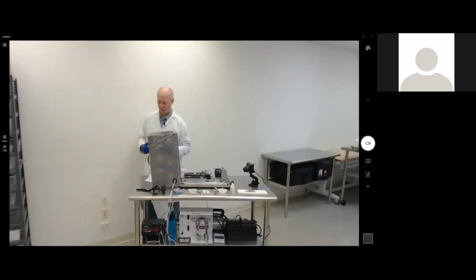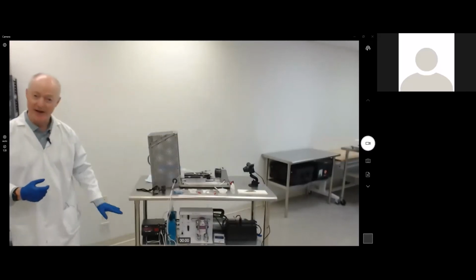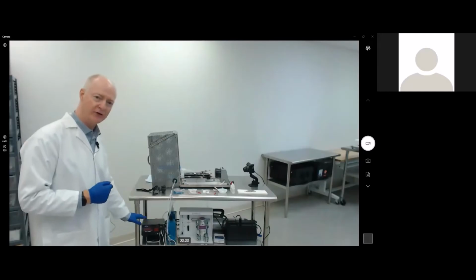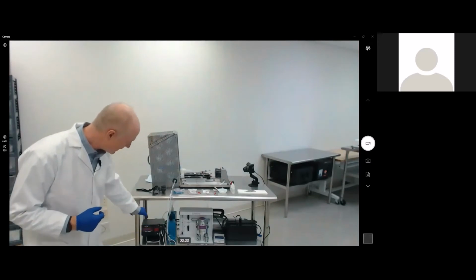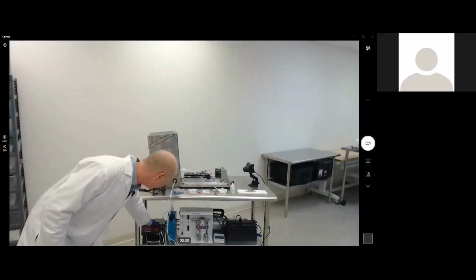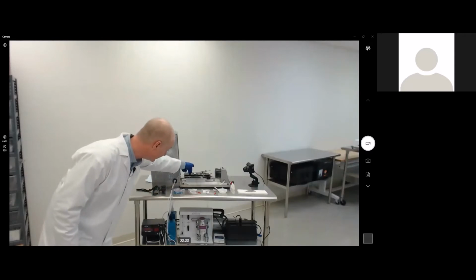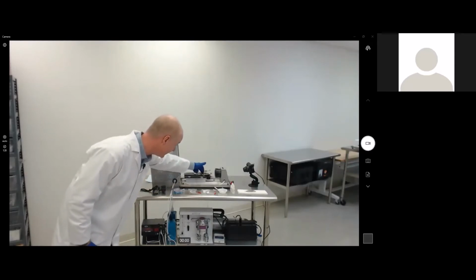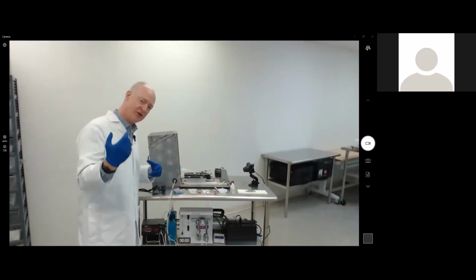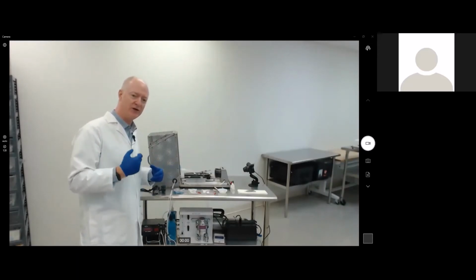So first and foremost, I'm going to go through the bottom bench here because these are all the parts that are actually required for conducting ERGs. Working left to right, we have a temperature controller. And this temperature controller is hooked to this plate that also has a probe for keeping the temperature of the mouse in line at 37 degrees Celsius, so we don't have a thermal loss, which can affect the results of the ERG.